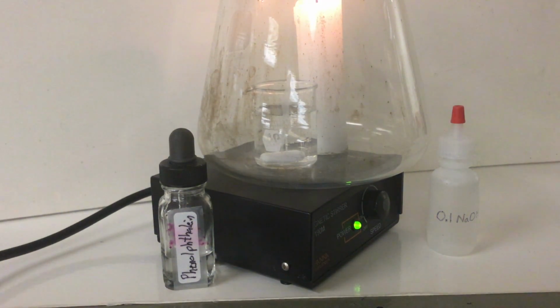Alright, Mr. G here. Welcome to the Magic Candle introductory demonstration. For this assignment, you're going to be observing the demonstration for the Magic Candle, and you're going to be trying to infer as to what's going on. You're going to be talking about as much chemistry as possible and making some inferences, some educated guesses as to what might be happening to cause the observations that you make. You're going to be talking a little bit about what this demonstration is an analogy for, and you'll understand a little bit more as to what I'm talking about here in a moment.